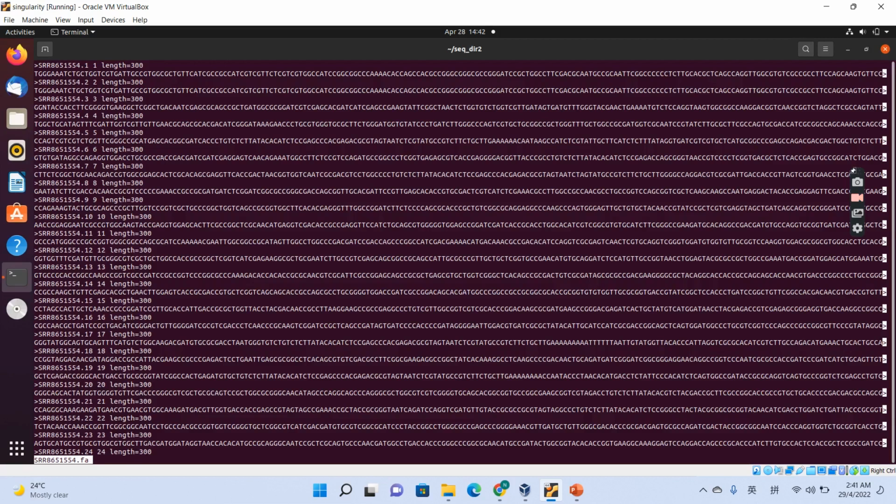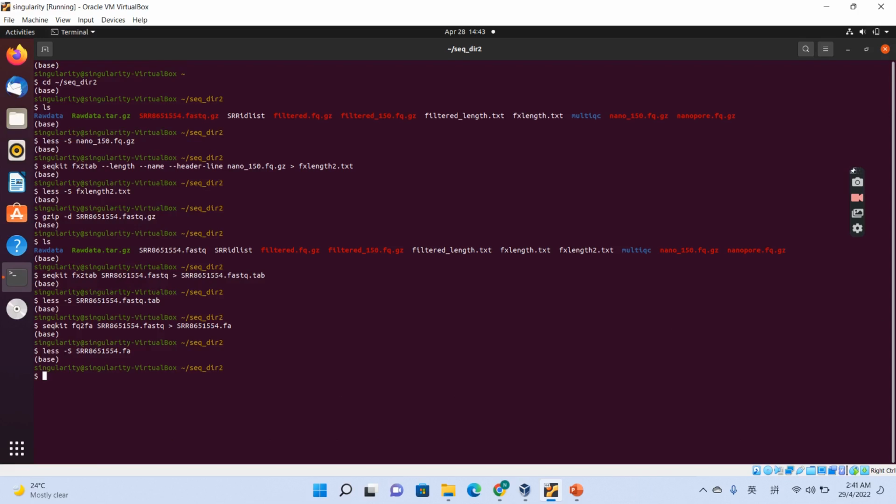You can see that from the 4-line FASTQ format, we have converted it to 2-line FASTA format. Type Q to exit.